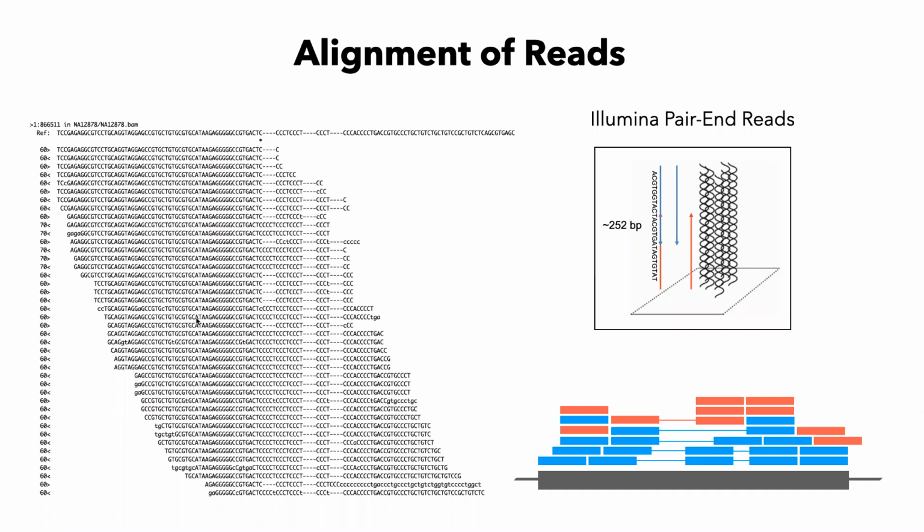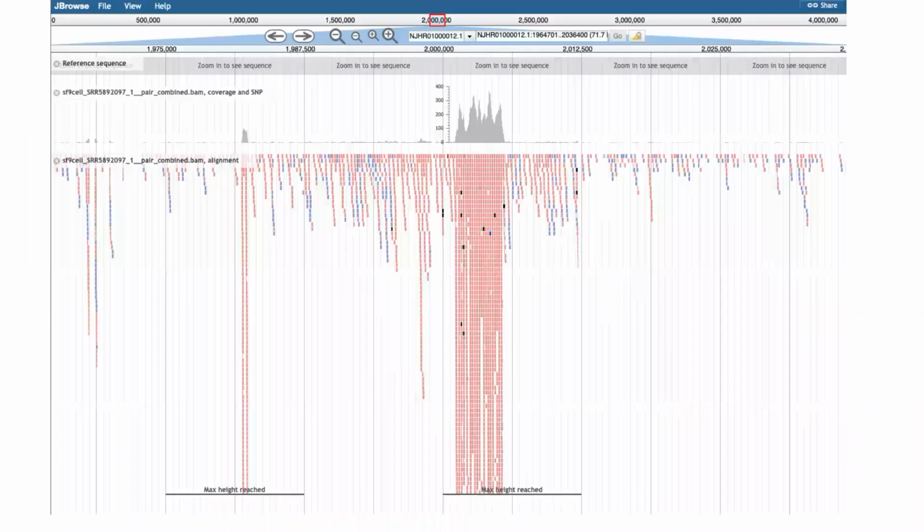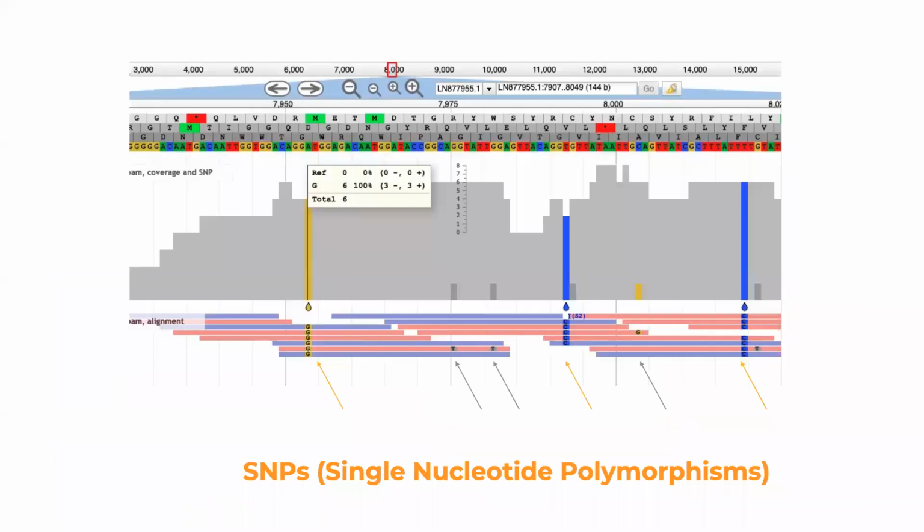It's an ASCII code, so it only has code, a binary code that we cannot see. So then we also talked about the alignment of reads to the reference genome, how we can visualize those reads, and we talked about identification of mutations or specific changes. How do we actually visually see them? And we talked about the chromosome and the specific position.